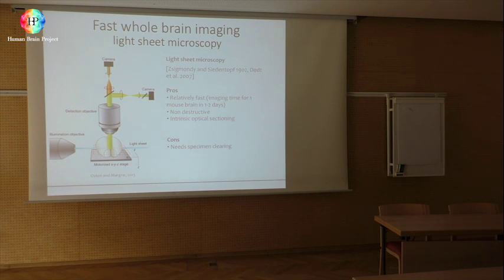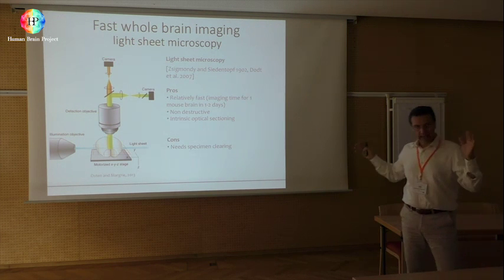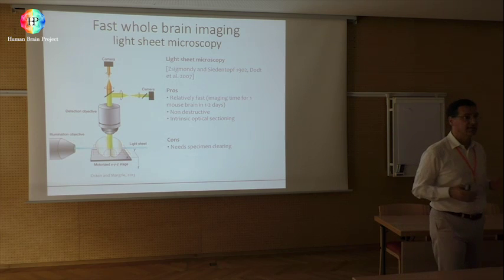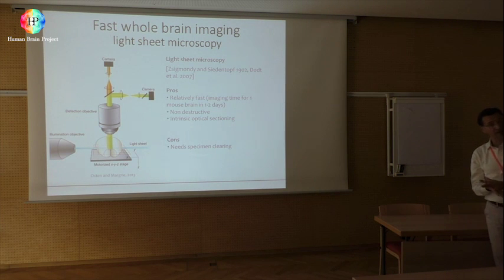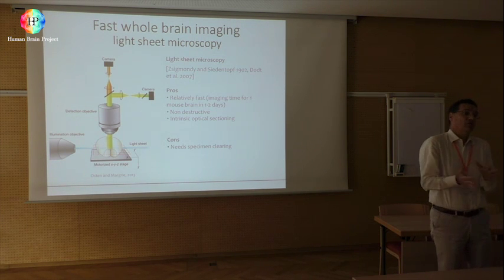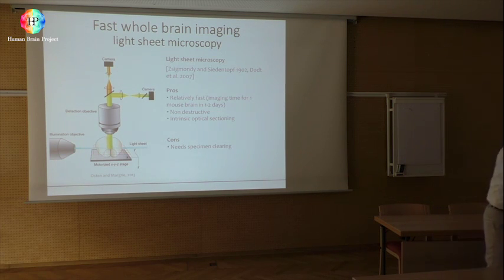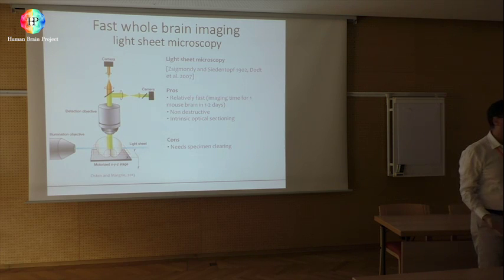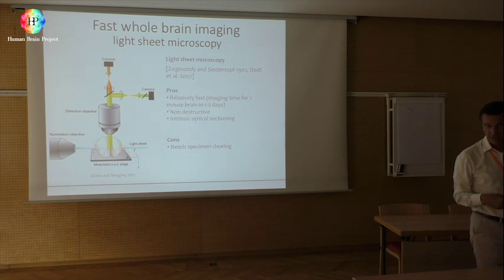Okay? The electron microscopy, there are many groups in the world, like the Denk group, the group of Javier de Felipe in Spain, the group of Lichtman in the United States, and many other groups. They are working on that. The approach is slicing pieces of the brain and doing electron microscopy, which has the enormous advantage of much higher resolution, but has the disadvantage of being time consuming. So to map the whole brain with electron microscopy takes years. Okay, so it's not possible.